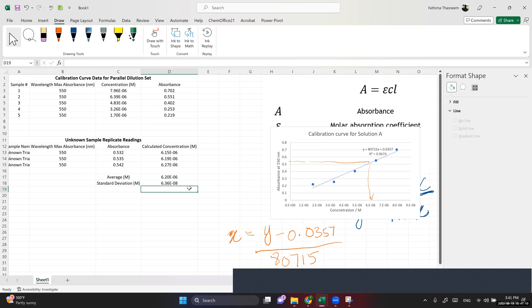I hope this video helps you to perform serial dilution calculations, apply Beer-Lambert Law, calculate concentrations from a calibration curve, and report the average and standard error.